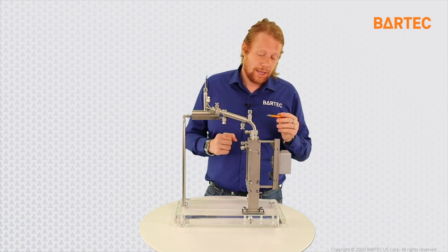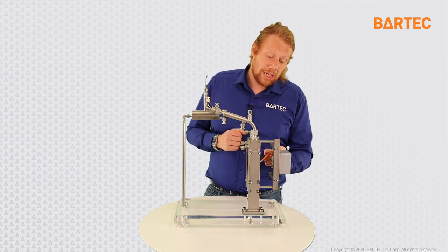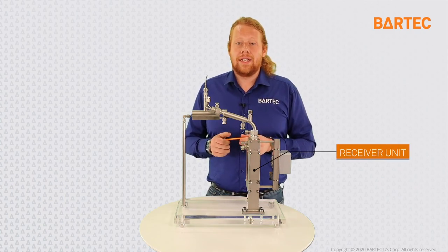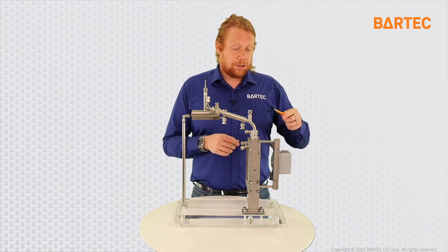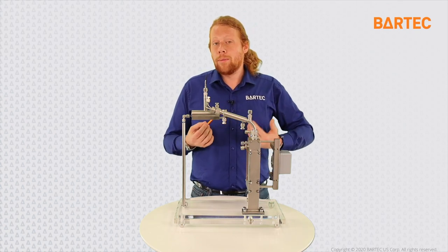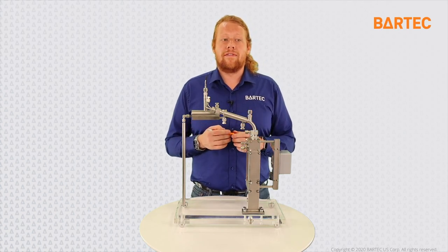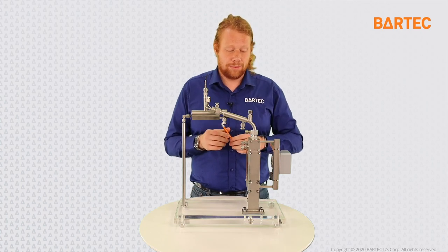As the sample is distilled, it then falls into a relatively large glass capillary that we call the receiving unit. The receiving or receiver unit is continuously monitored by a camera, thus allowing a tracking or monitoring of how much sample has been recovered and or evaporated depending on how the internal calculations in the analyzers are set up.